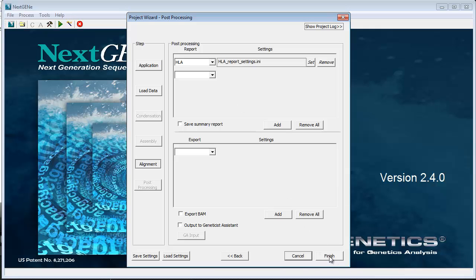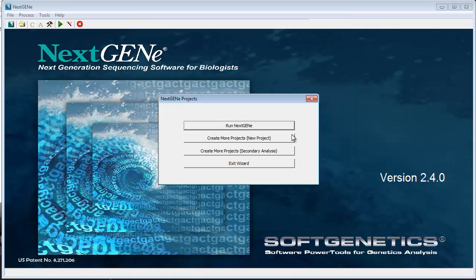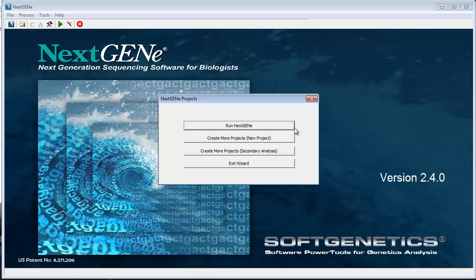Click finish. You can click create more projects, new project to set up the analysis for a second sample. Multiple projects created this way will then be processed consecutively. Or click run NexGene to begin processing.